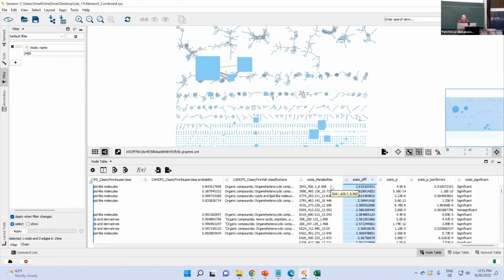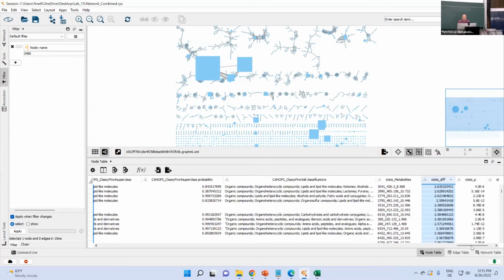And then what was the highest number, the strongest upregulated or produced compound in the algae, right? And if it was negative, then it was lower. So that was perhaps a suppressed feature in our DOM background. Okay. So now, I sorted this here simply by clicking at the header.